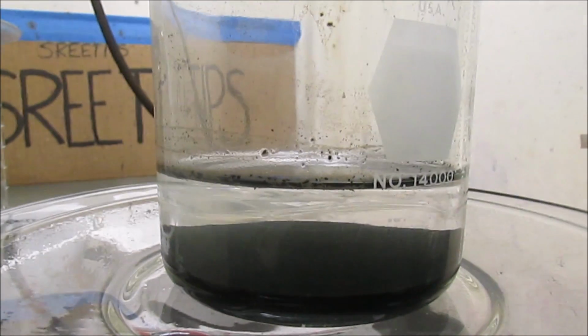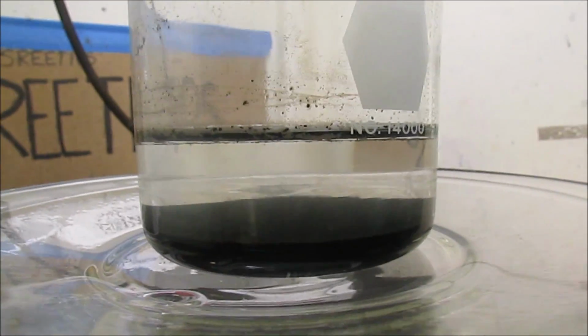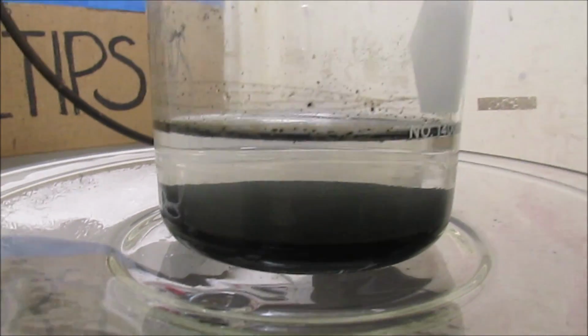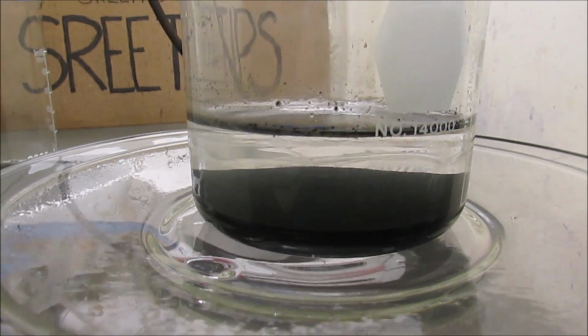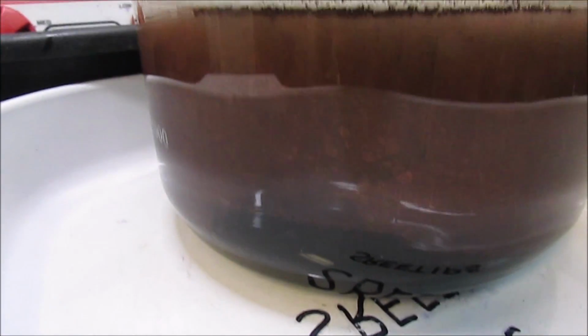Here's our sample from the SMB beaker that we started, what was that, way back in part 2. That's platinum group metals that are precipitated out, that I've taken the acid off of it. It's just sitting in water there. Wow.